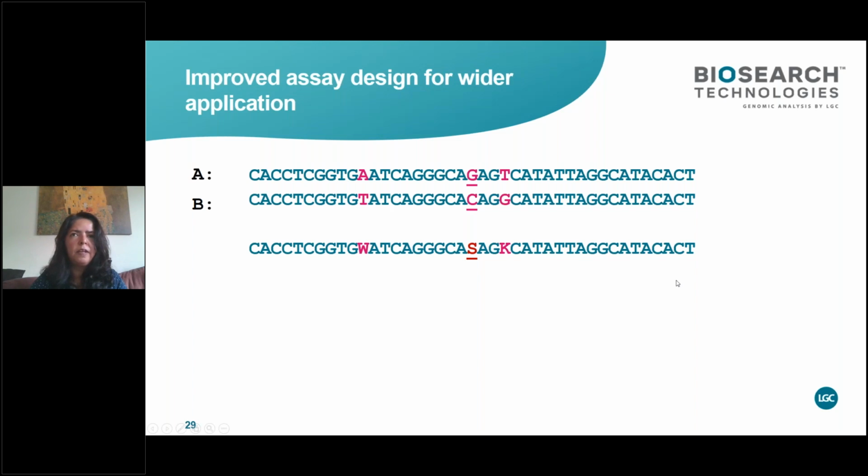The SNP can be identified by the underscore, and it's represented by the IUPAC code S, which conforms to a GC SNP. We have variation in the surrounding flanking regions within 50 base pairs, which have also been replaced with an IUPAC code to incorporate variation. If these markers were developed, they would work very well in these two particular varieties.